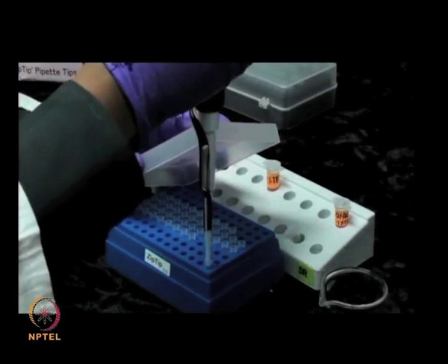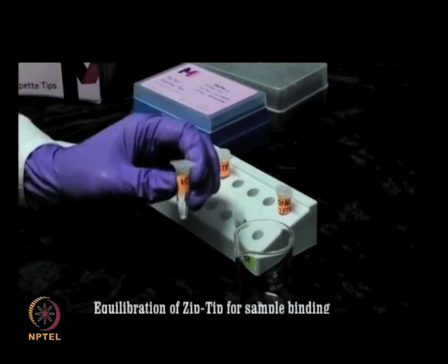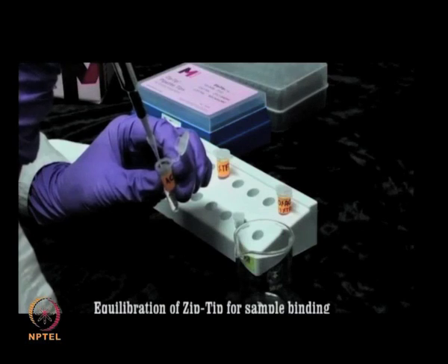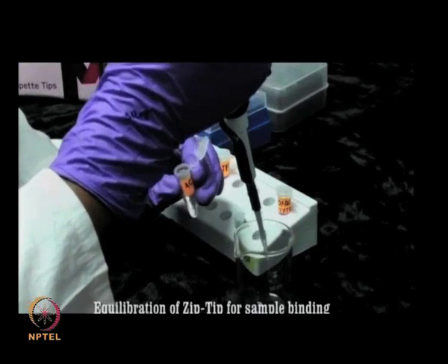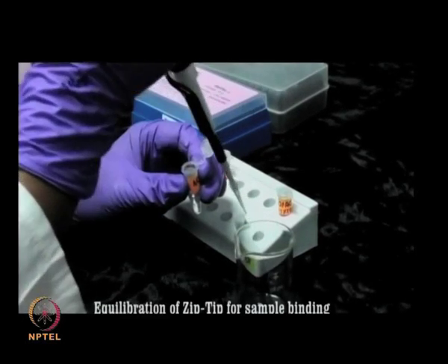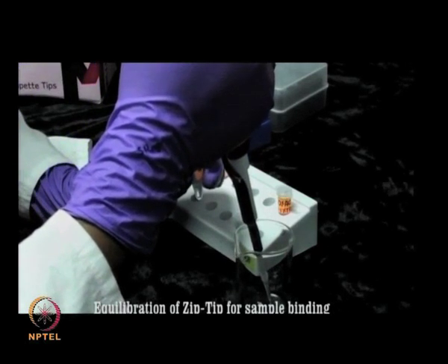The in-gel digested protein samples are further processed by using zip tip pipette tips, which contain C18 or C4 media for enrichment of peptides prior to MS analysis. Zip tip pipette tip is a 10 microliter pipette tip with a bed of chromatography media fixed at its end. It is used for concentrating and purifying peptides as well as removing salts, detergents and interfering agents.